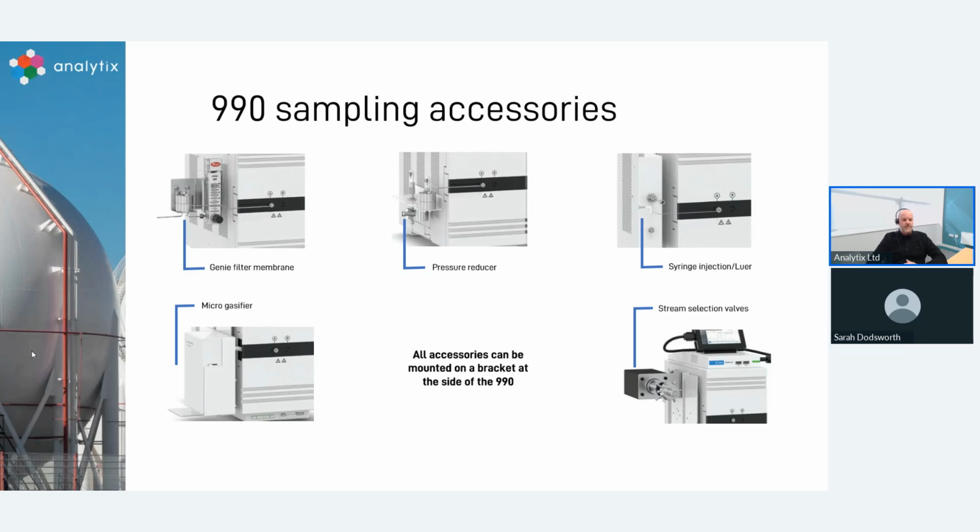There are other options available in terms of sampling. So if you have very low sample volume, that can often be an issue, because we need to have a certain amount of sample to be representative through the system and a certain pressure to come in. There are options that we can work with third parties to help with this as well, whether that's introducing a sample pump or a dedicated system to build the pressure up for us. Essentially, anything that we need to do for conditioning beforehand, we're available to discuss this with the end user.